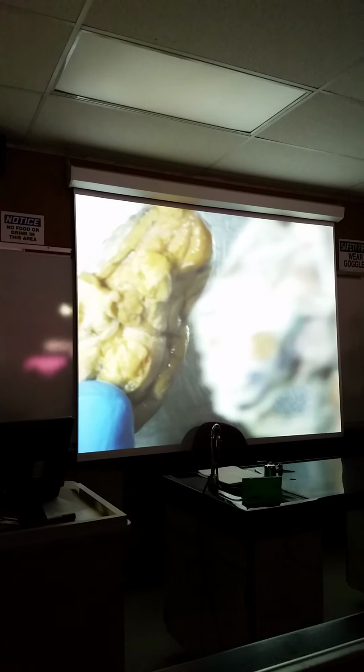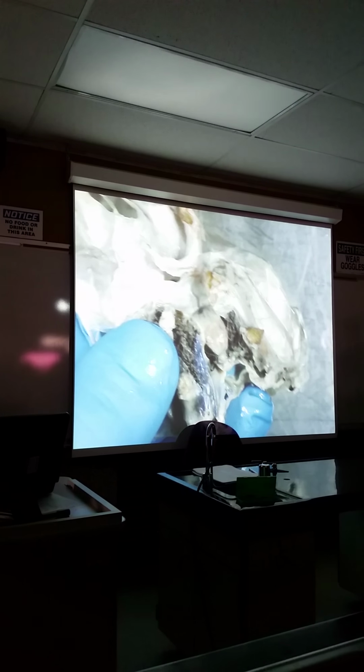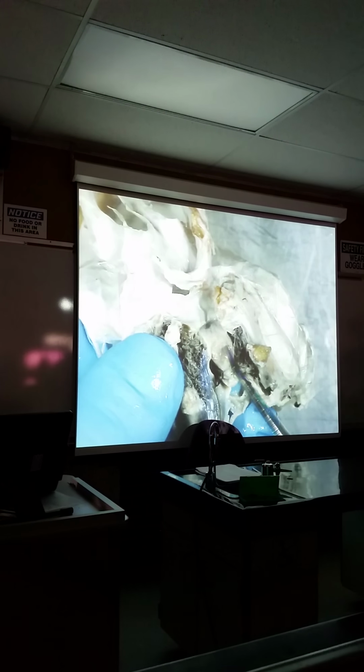Here's the pituitary. Right there. See, when they ripped the dura mater off of this, they ripped the pituitary off. That's the pituitary right there. Can you guys see that? Yeah, right here's the pituitary.